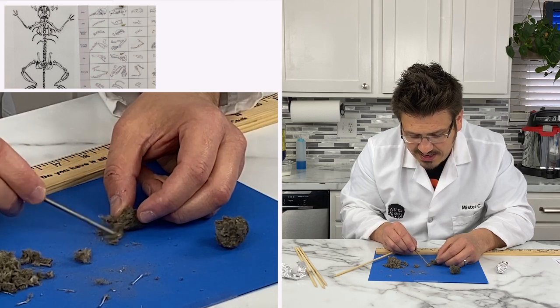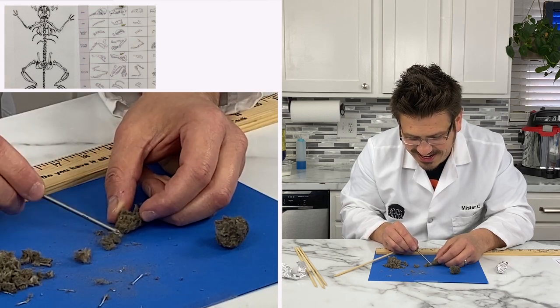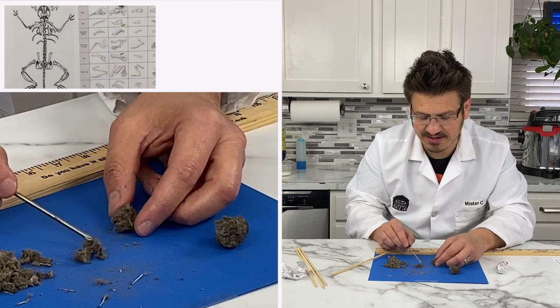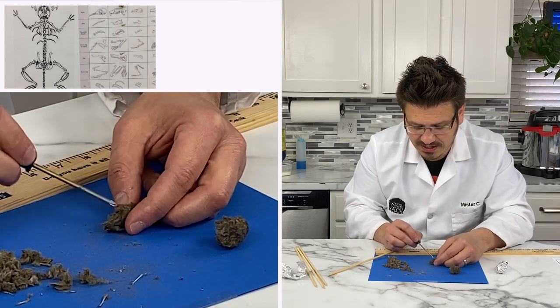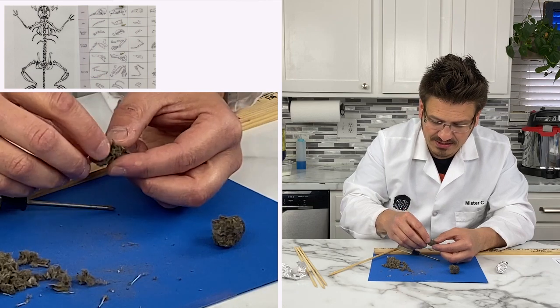I know what someone's going to ask me. They're going to say, if I find an owl pellet, should I dissect it? No. These are sterilized. So they've been heated and sanitized so that we can handle them.